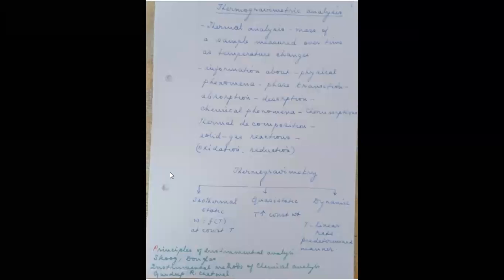So first we are going to discuss thermogravimetric analysis. We have already seen what a thermogravimetric analysis is. It is the thermal analysis where the mass of the sample is measured over time as the temperature changes. Sometimes the temperature is maintained constant and the weight change with time is noted. Sometimes the temperature is changed and how the weight changes with the temperature is noted.